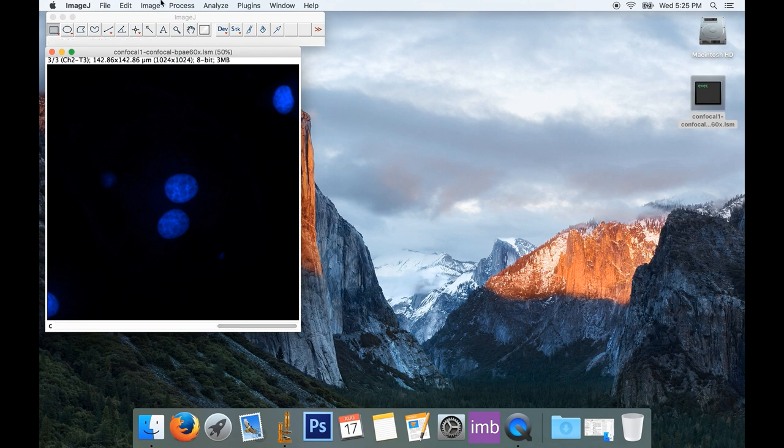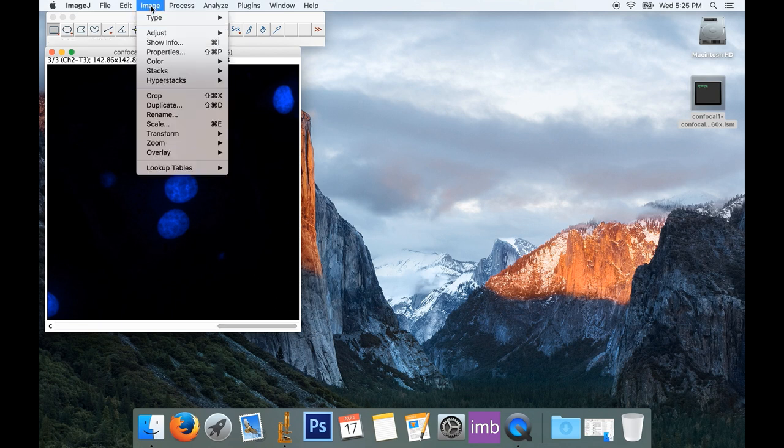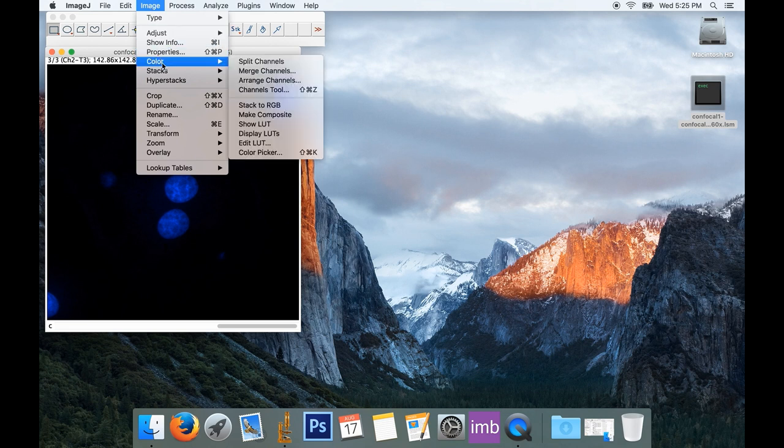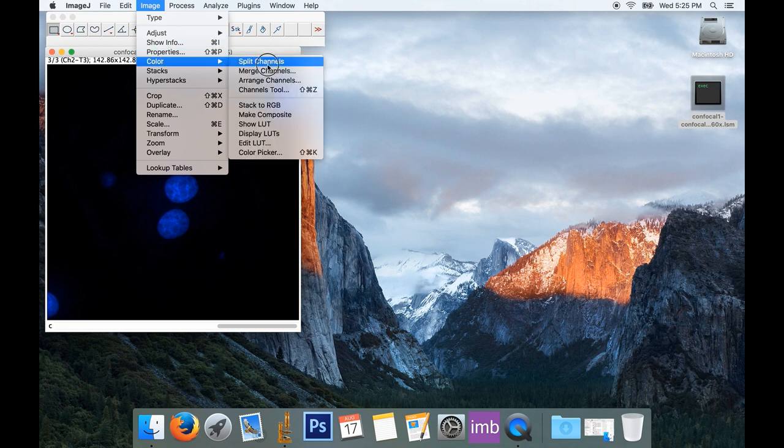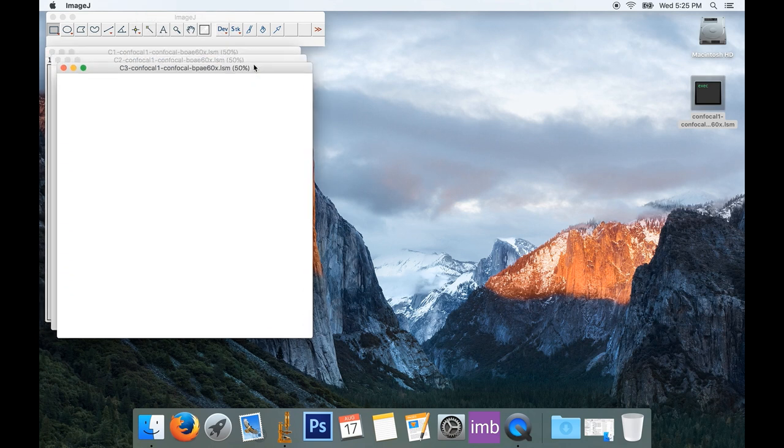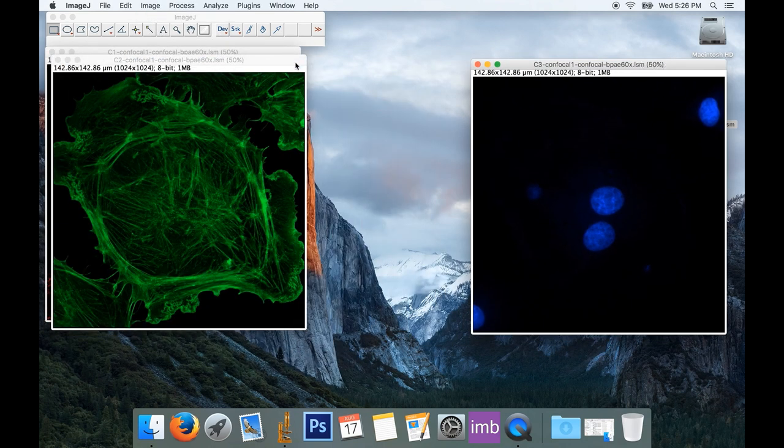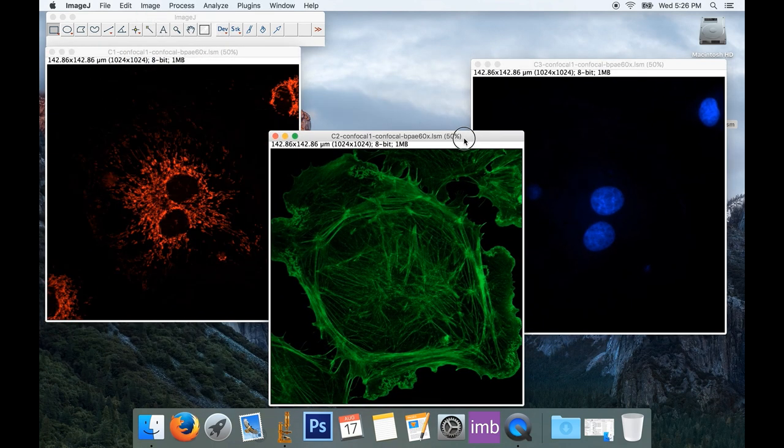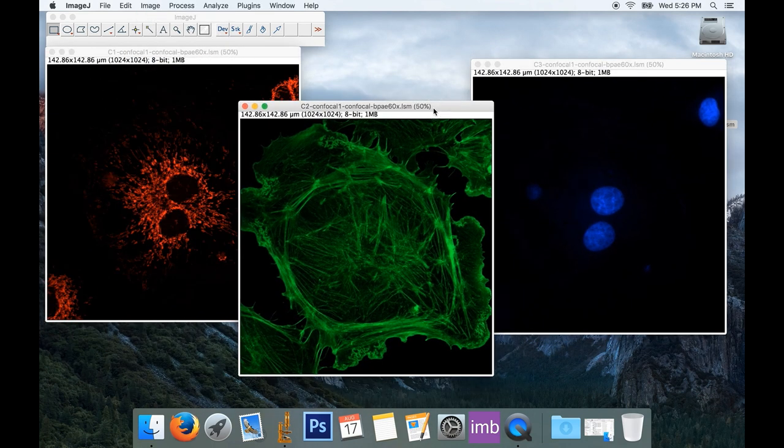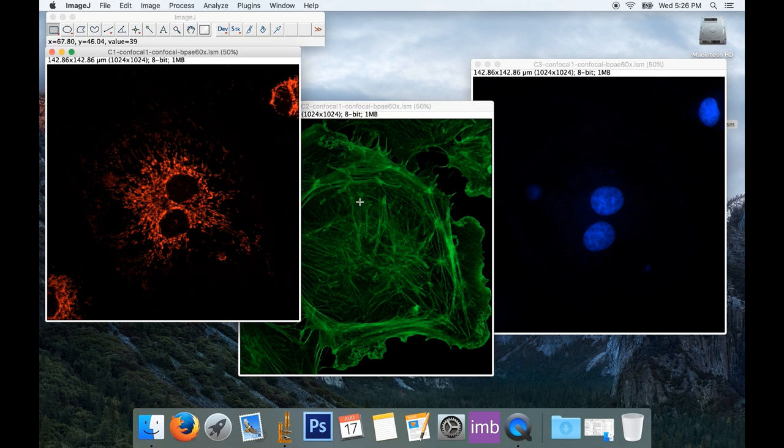So if I go to the menu and choose Image, Color, and Split Channels, you can see it splits my image into the three constituent channels.